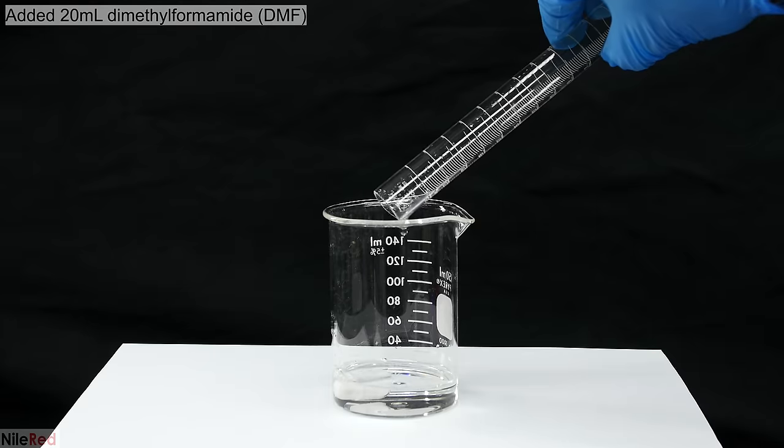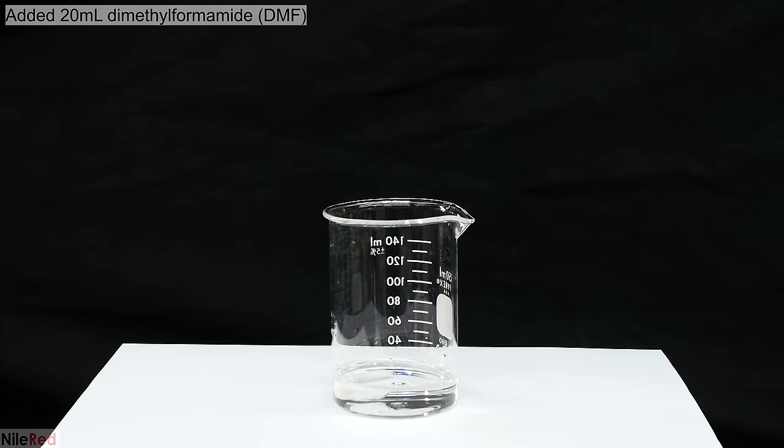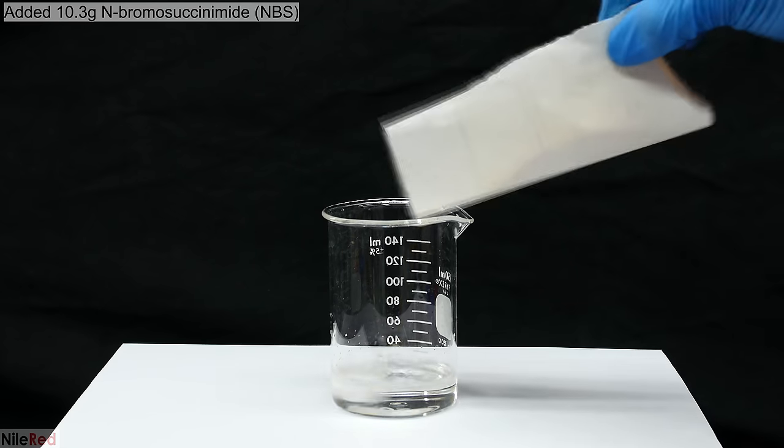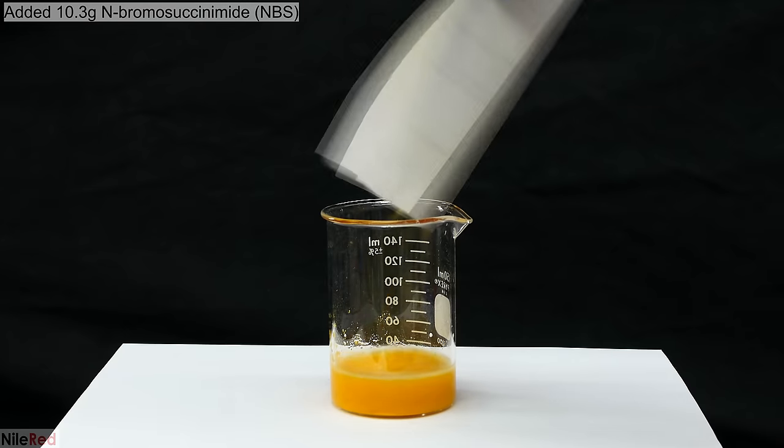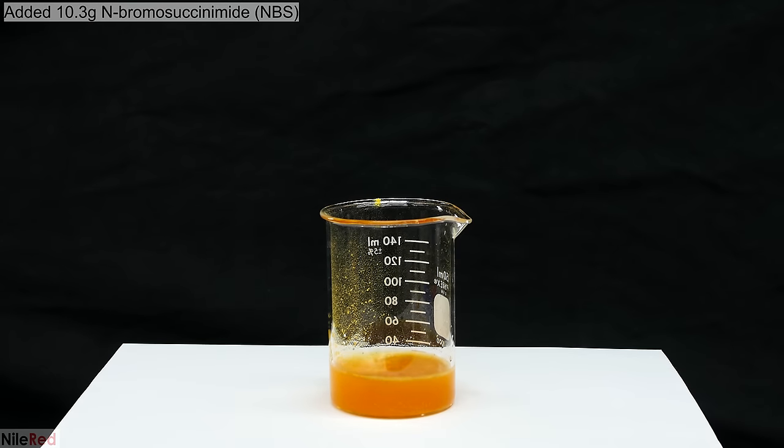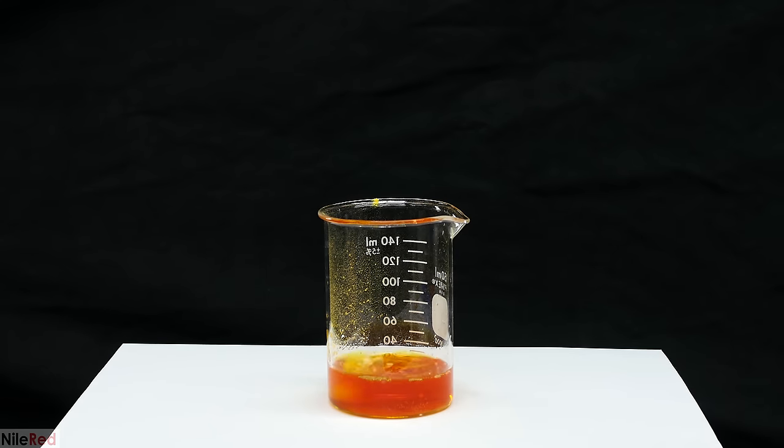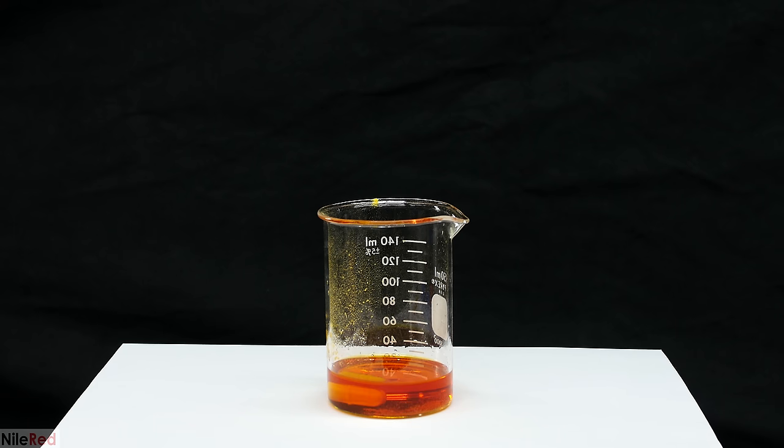To do this, we start by adding 20 milliliters of dimethylformamide, also known as DMF. Into the DMF, we add 10.3 grams of N-bromosuccinimide, or NBS for short. The mixture is stirred until we're left with a clear solution and all of the NBS has dissolved.